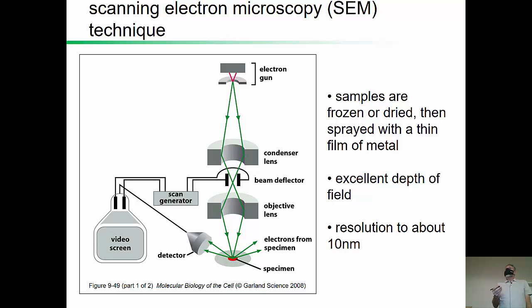And they have to bounce off something electron dense, so we start by just coating our entire sample in a very, very, very fine layer of gold. Okay? Just a couple of atoms thick. And so that will reflect the electromagnetic waves, and instead of collecting the image at the bottom, we collect the image at the sides, so we're catching the reflected rays.